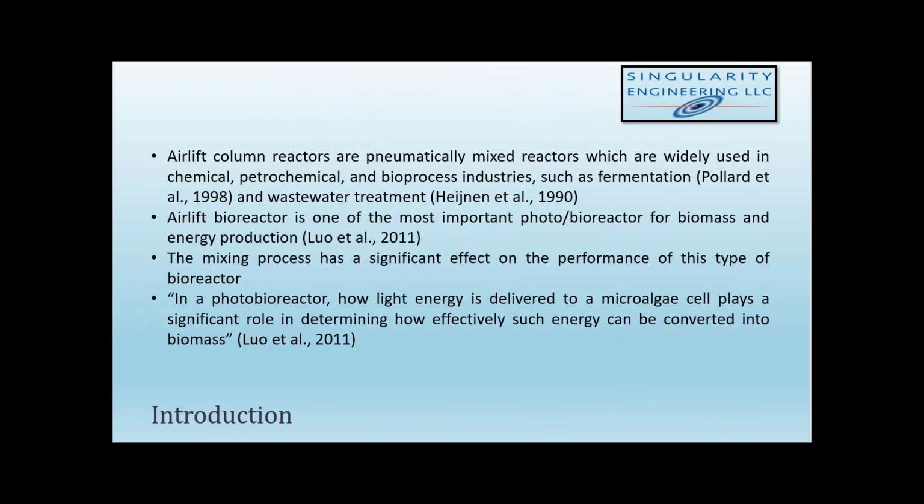An airlift bioreactor can be defined as a pneumatically mixed reactor which is widely used in chemical, petrochemical, and bioprocessing industries such as fermentation. It is also one of the most important reactors for biomass and energy production. In this type of reactor, the mixing process has a significant effect on the performance.